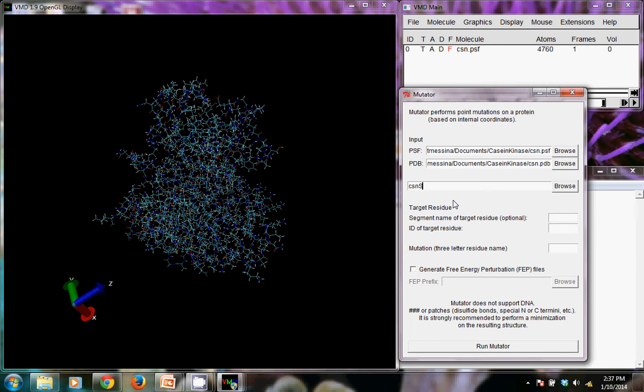And then I'm going to give it the mutation that we're making, which is mutating from serine at position or residue number 179 to aspartic acid, which has the label D.